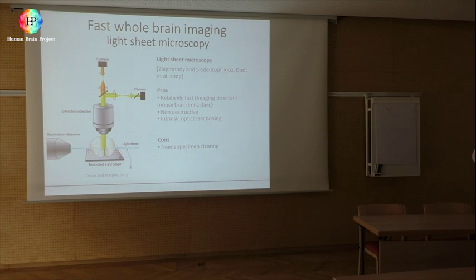I will describe later why you need 1 month. But the pure optical imaging can be 1 week for the whole brain with 2 photons, because you need to move the beam like this, which is much faster than 1 year with electron microscopy. But it is anyway 1 week, which is not very fast, let's say.